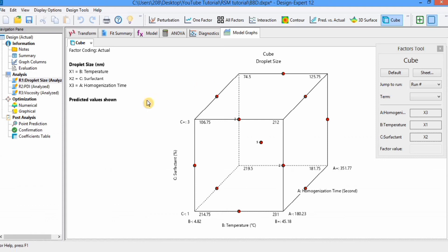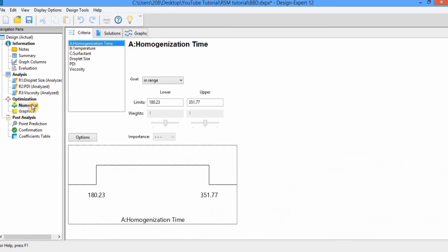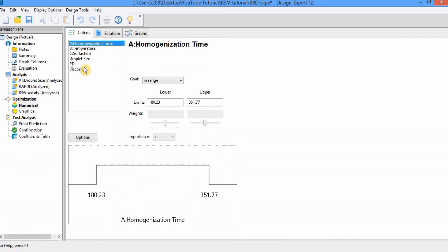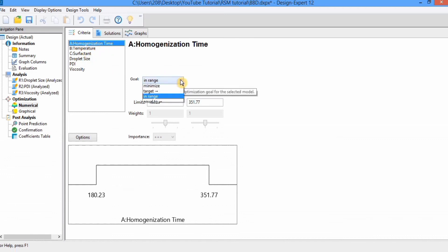Now we move to optimization. There are two options: numerical optimization and graphical optimization. Graphical optimization is not mostly used — numerical optimization is preferred, so I will use this one. In numerical optimization, first you will find the criteria tab where you set your criteria for independent variables as well as responses. For example, for homogenization time I want to minimize it.